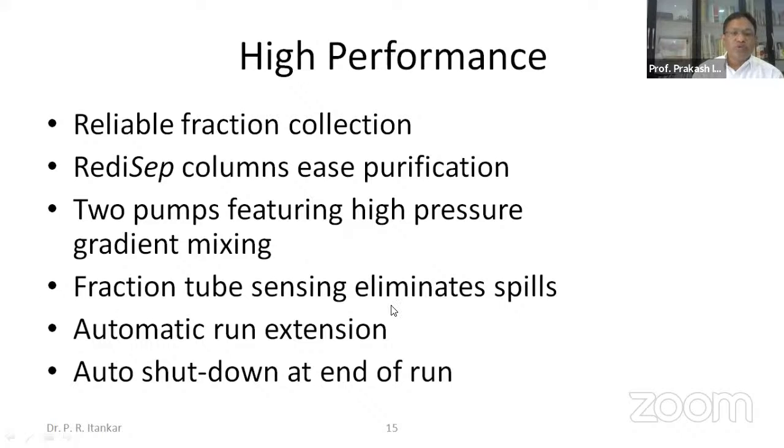Fraction tube sensing eliminates spills. So it will never take one constituent right up to, say, 10 test tubes, and then again get spilled into the next one. No, once the second constituent has started coming out, it will stop collecting or mixing it with sample A.